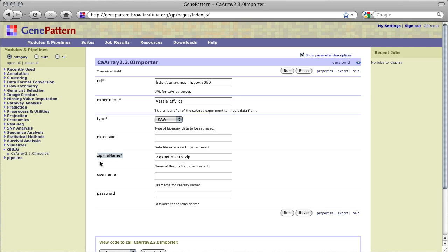The zip file name parameter allows us to specify an output file name to be used for the resulting .zip file. If not specified, the experiment name with any spaces replaced by underscores, as in all GenePattern modules, will be used as the output file prefix.